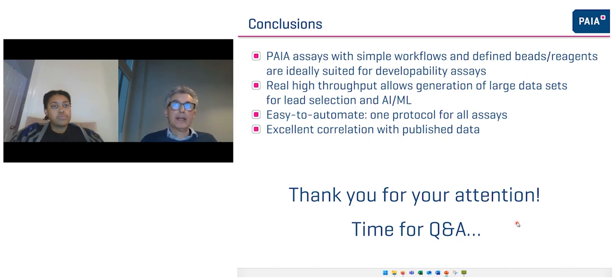Yeah, also a great question. So we know we can go a little lower than the 5 that I mentioned in the presentation. I think we're a little bit limited by the amount of fluorophore that we need to be able to detect, but we know we can go down to like 2 or 3 microgram per mil, but much lower would be maybe a bit complicated, or would at least require us to develop a different kind of detection.